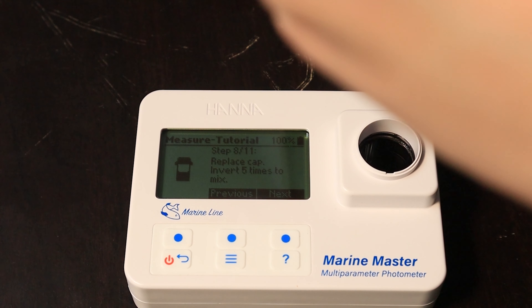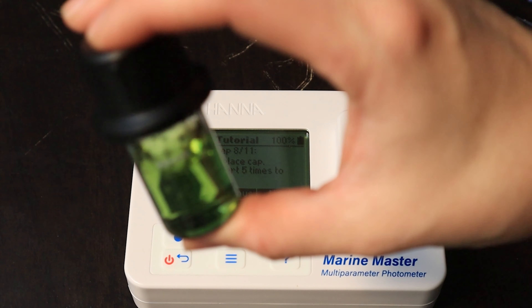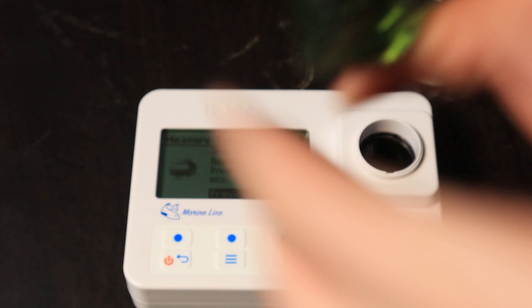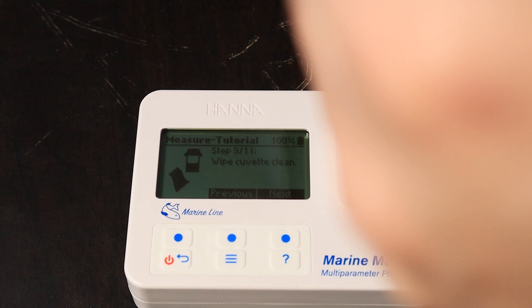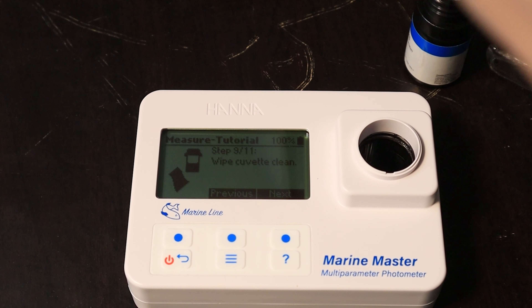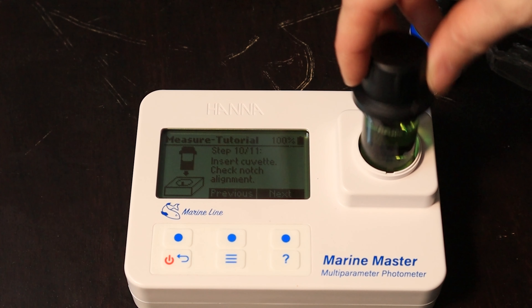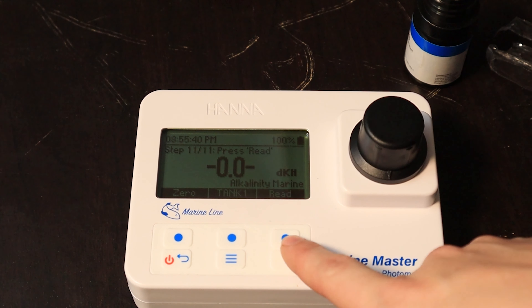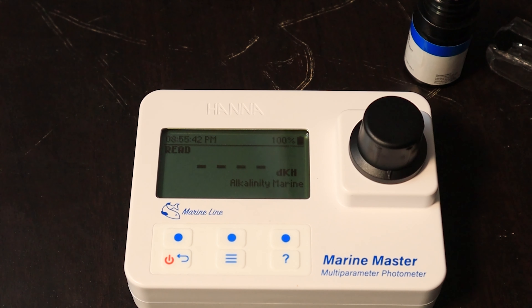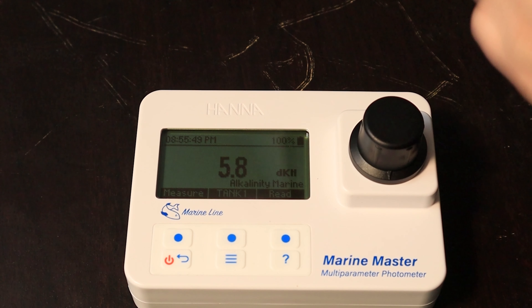Put the cap back on, invert five times — I might have done more than five, doesn't matter. Wipe it clean. Hit next, insert it back in, hit next, and then you just press read. 5.8 — super low. I knew that. It was pretty much dead on with my Trident.